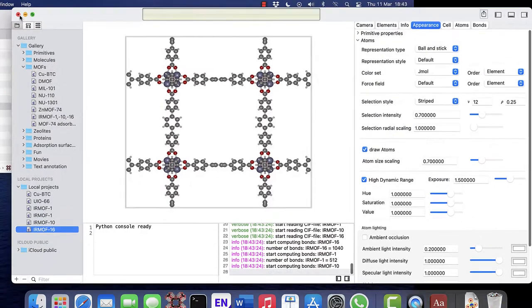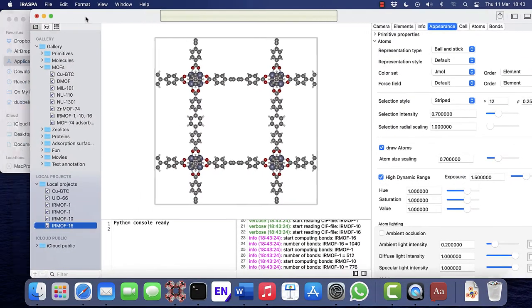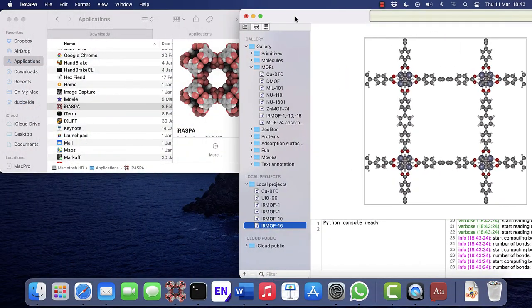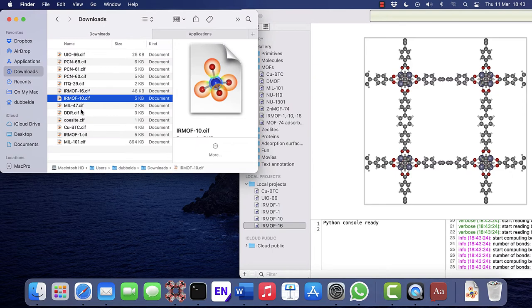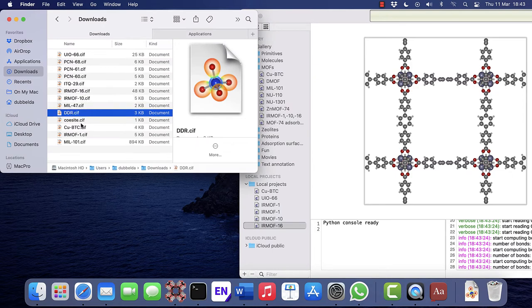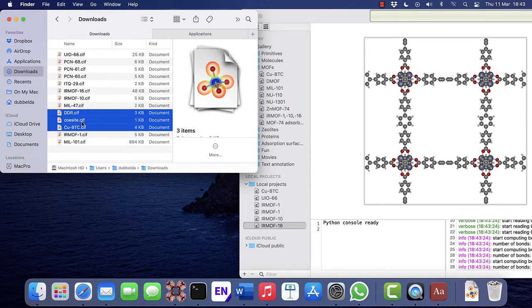Another way of importing structure files is to drag them from the Finder and then drop them in the project navigator in the Local Projects section. The blue line denotes the insertion point.